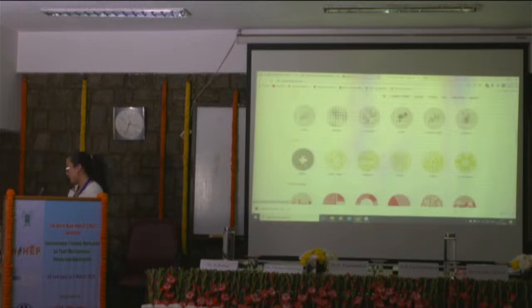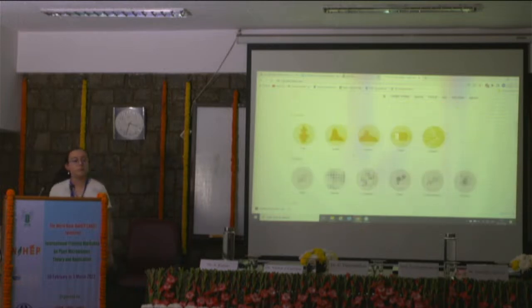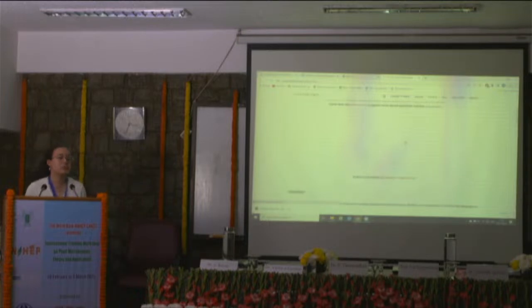Many, many of them. And then let's say you want to do a plot from this. So I want to do a box plot. I'm going to click on box plot. And then they even take the time to explain, in case you're not that familiar, you just found, oh, this plot looks interesting, I wonder what it does. They're going to explain it to you as well.